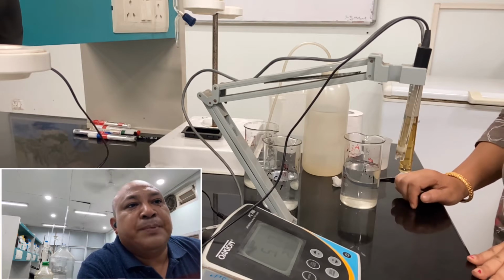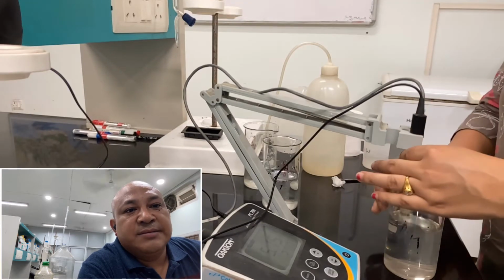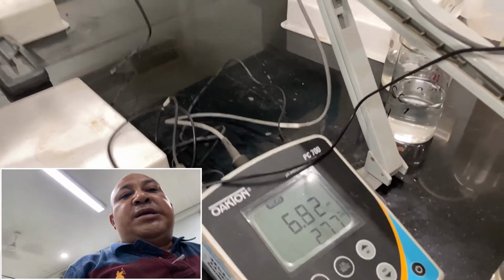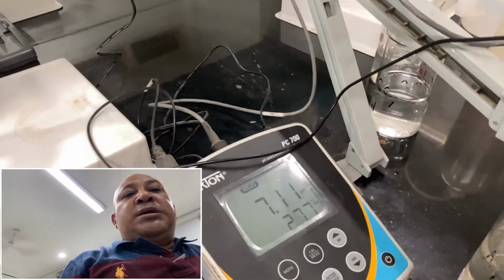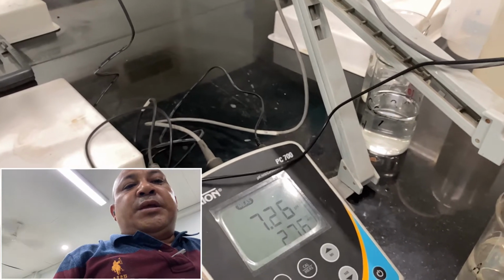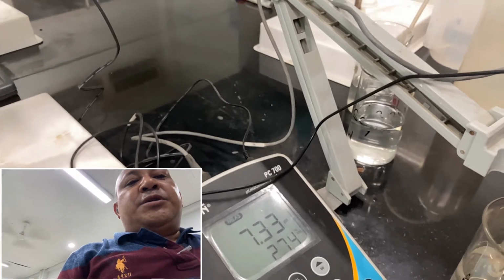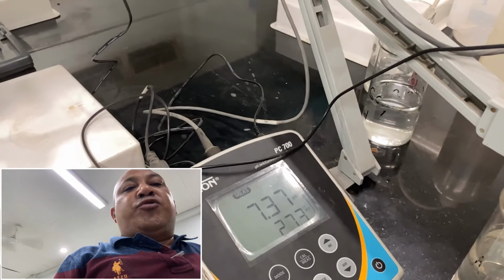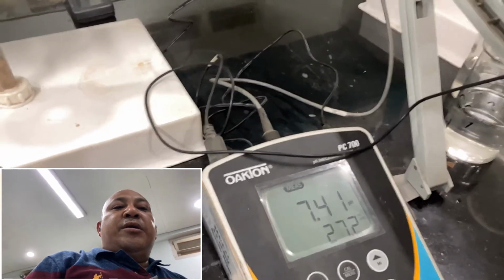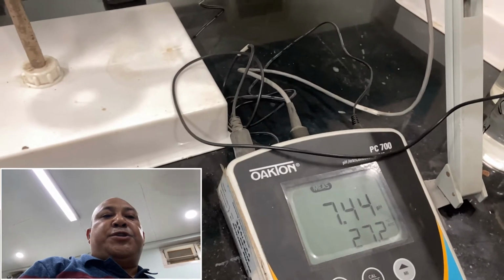So here we will dip the first sample, and you can see the pH is coming around 6.8 to 7.11. It is very close to the neutral pH. Below is the temperature, 27.6. So the pH is around 7.37. Once the fluctuation is over, a reading will come mentioning ready. Once the ready symbol comes, you can consider the pH of the sample.